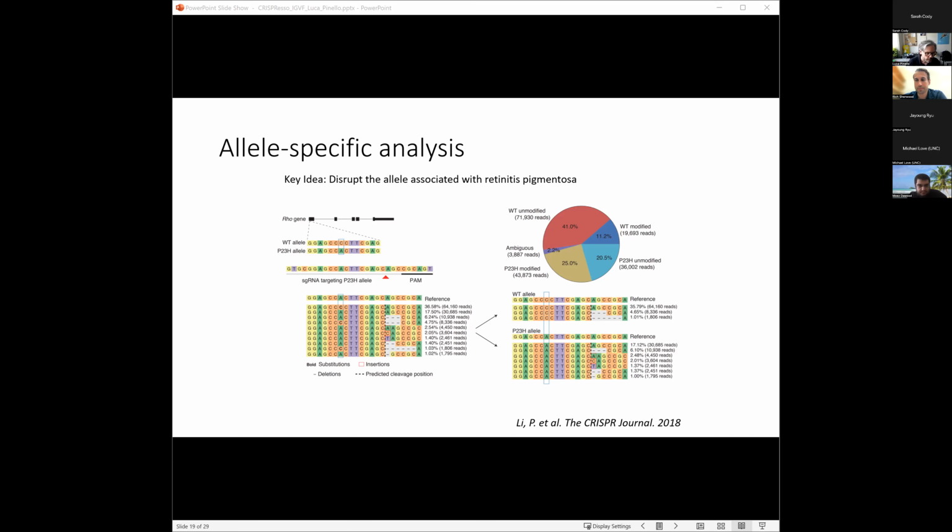Okay. Luca, you could also describe our recent preprint on off-target effects that are variant specific with therapeutic gene editing, where this aspect of CRISPResso to identify allele-specific events showed an off-target that was exquisitely allele specific. So I think there are clinically relevant examples. Yeah, thanks, Dan. This preprint that Dan mentioned is another tool with Dan. It's called CRISPR-Me, and I will put the link in the chat if people want to take a look.